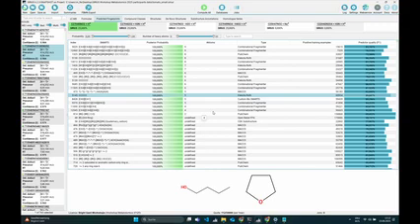Yeah, so Markus, maybe you can comment on that. In general, as long as the features have the correct adduct assigned, mixing them in feature-based data works. We cannot preprocess them together right now, but if you get your preprocessed data from MZmine, it should work.